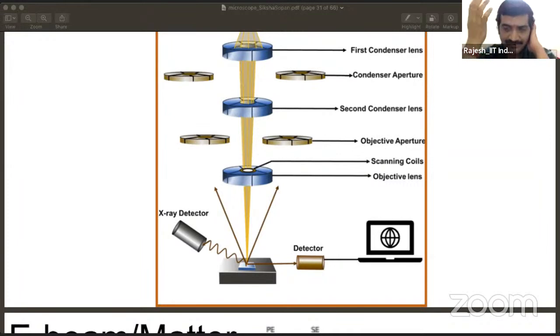And the radio wave has what wavelength? We all know it is in the microwave and radio wave range. So it is not even necessary to fall on the eye. The eyes will sense wavelengths of 400 to 700, and then it looks like we can see something.